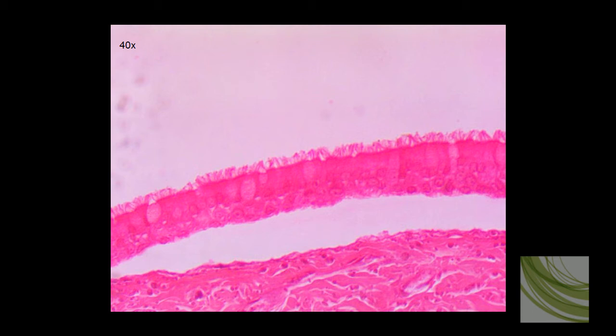Now, here we can see it's separated from the dense irregular tissue, but here is the pseudostratified ciliated columnar epithelial tissue. We can see some goblet cells, which produce mucus, and we can see very clearly the cilia on the surface of this tissue.